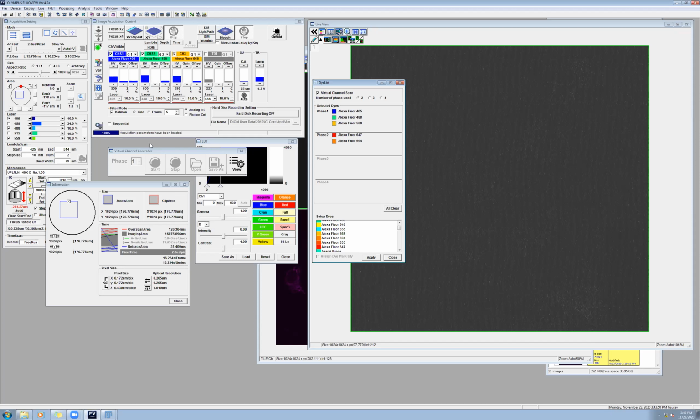And I'll go back to my phase two. And it takes about 10 odd seconds to set everything up.